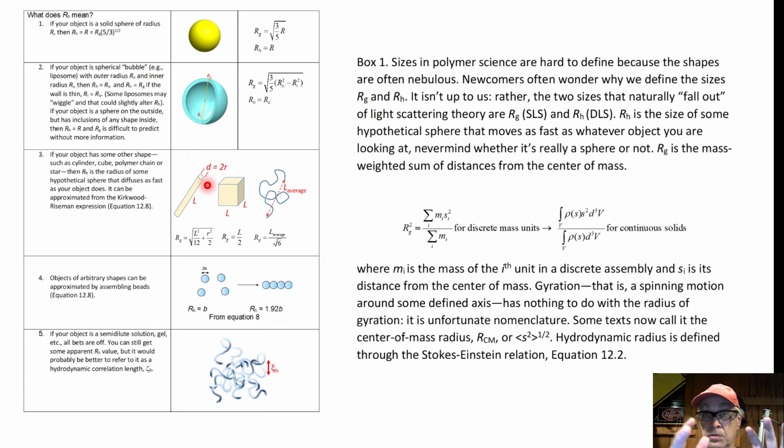Suppose you have a cube over there on the other side of campus. There are people making little cubical silver particles. They're making little triangular silver particles. All sorts of things like that can be made. You can measure their diffusion coefficients. They go a certain speed. They have a certain diffusion coefficient, I don't know, 10 to the minus 7th square centimeters per second.